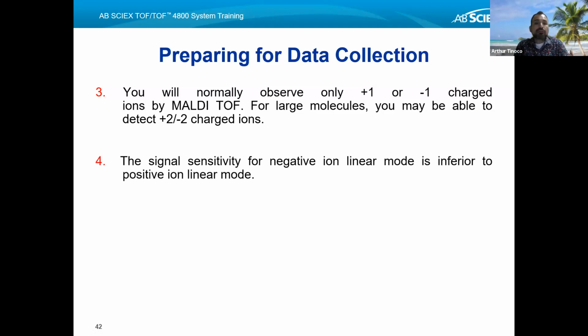Another really important thing is the signal sensitivity. It turns out that for the negative ion linear mode, remember linear mode is for the big molecules, the signal sensitivity is much inferior to that of the positive ion linear mode. So my suggestion is to stick with the positive ion linear mode.